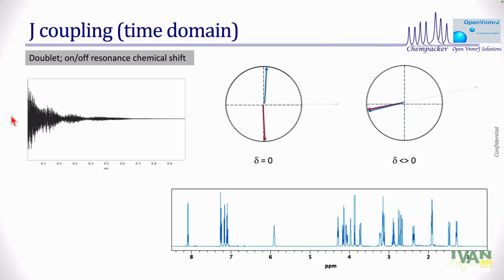So when we acquire a spectrum like that, all we do is get all frequencies, meaning that these doublets or multiplets or quartets all show up as individual peaks in your spectrum. So that's your coupled spectrum, and this one happens to be strychnine. I'm sure there are many of you who know the strychnine spectrum by heart.